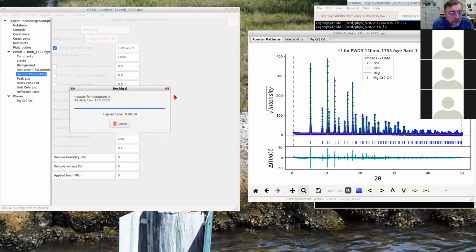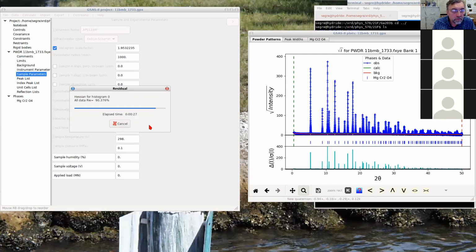So the other thing you can do is basically start fresh. Sometimes it's useful to start fresh. And the third thing I can do is cut the data. So I only look at data where it's relatively flat, because this is certainly not working very well. I'm having some trouble adding those additional parameters. Yeah, this is not going to work well.